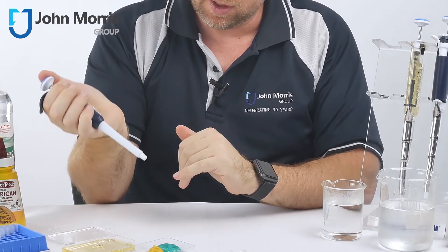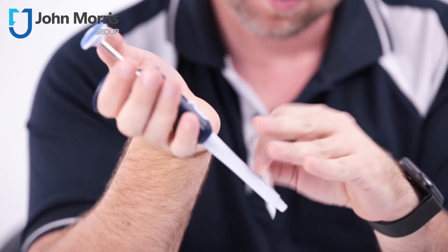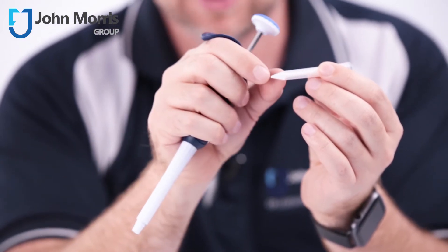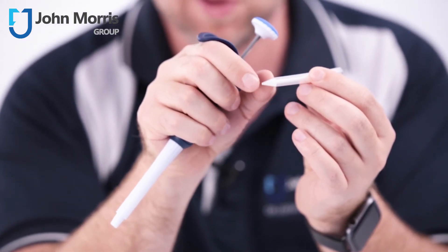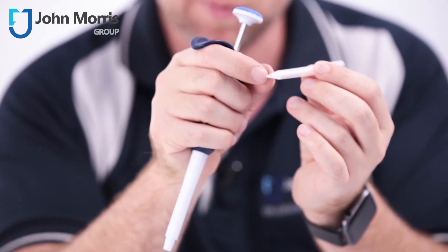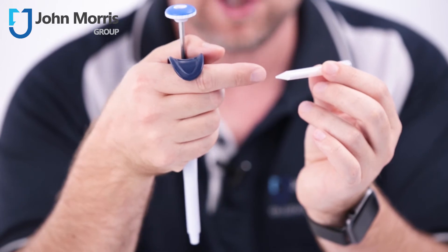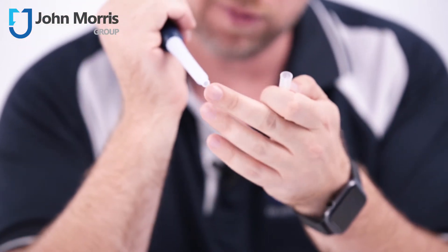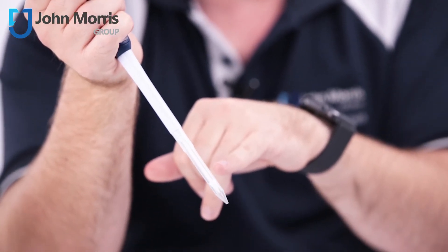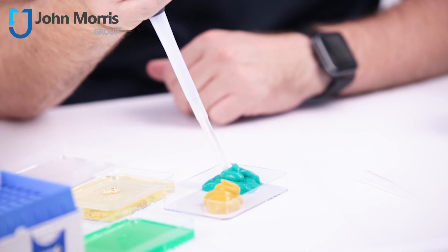This is the Gilson Microman, and it comes in two pieces: the pipette itself and the tip. Inside the tip you can see a white piece — that's the piston within the tip itself. The liquid makes direct contact with that piston, so there's no air gap to allow things to expand, contract, or get past the barrier into the body of the pipette. On the new version it's very easy to load — just click and it's in. Let's try this with some toothpaste.